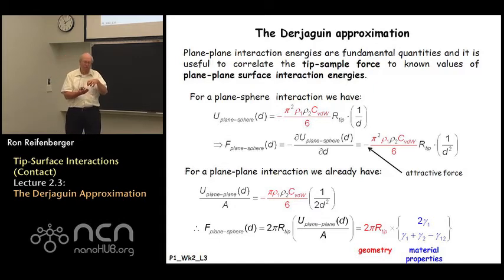And if you can in particular measure the force of attraction of a sphere as it comes closer to a flat plane, as a function of the separation distance d, if you know the radius of the tip or radius of the sphere, it should allow you to estimate material properties, surface energies or interfacial surface energies, depending on whether the sphere and the substrate are made of the same material or if they're made of dissimilar materials. So this is a very fundamental result.